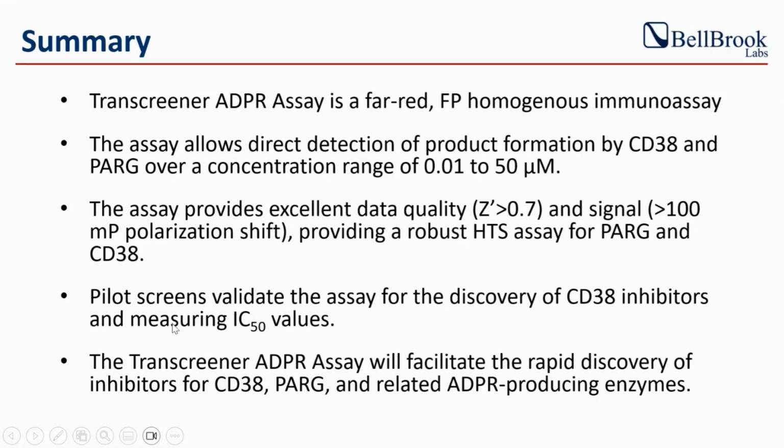And then I have shown you the pilot screen and also the dose response profiling for CD38 and for PARG. And I really hope that the Transcreener ADPR assay will facilitate the rapid discovery of inhibitors for CD38 and PARG, and also other related ADPR producing enzymes.